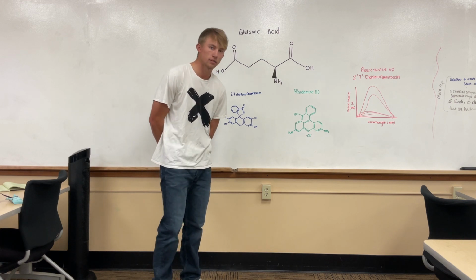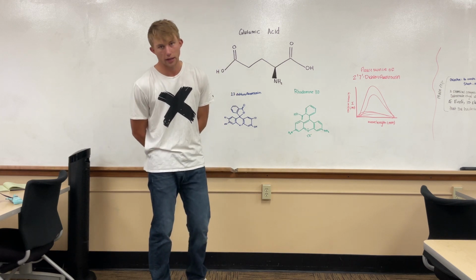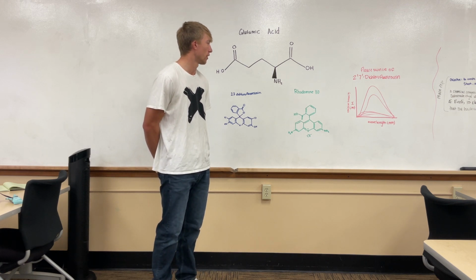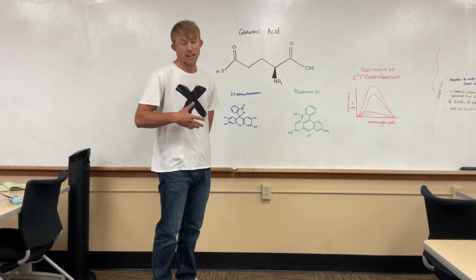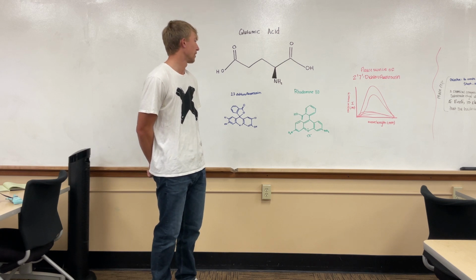We kept 3 milliliters of our stock solution, and then we changed the concentration of glutamic acid as well as water in our cuvettes. We found that gave the most consistent results with one another. So those are our hints for you, just to help you further along your procedure.